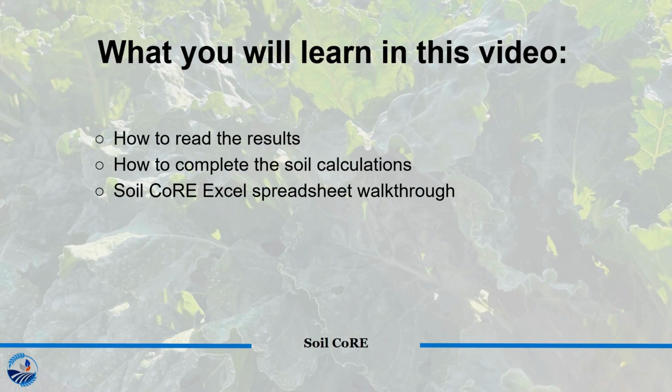In this video, you will learn how to read results from a lab, how to complete the needed soil calculations, and a walkthrough of the Soil Core Excel spreadsheet that will help report all of the needed information.